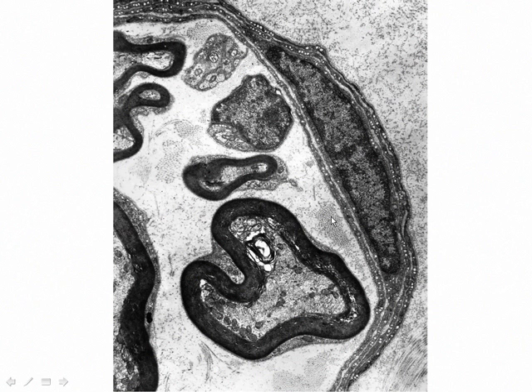Just outside the myelinated axon is endoneurium, and then you have this cellular layer. This is a very good representation of perineurium. Here is a perineurial nucleus, and you can see that it's very flattened. You also can see that there is a cell here. You can't see the nucleus. So it looks like there's 1, 2, 3, maybe 4 layers of perineurium, and their job is to insulate what's inside the nerve from the outside world.